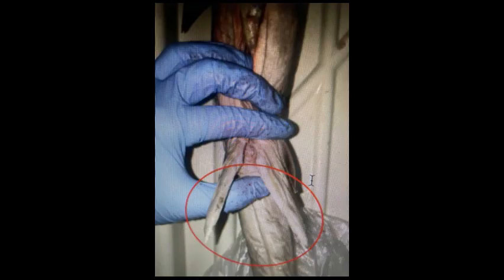Alright, our last part is about the reproductive system. The reproductive system in males and females is quite different in sharks, especially the expression of the primary sex organs. Besides, a very typical characteristic in male sharks is that their pelvic fins turn into claspers, the organs to hug female sharks when mating.